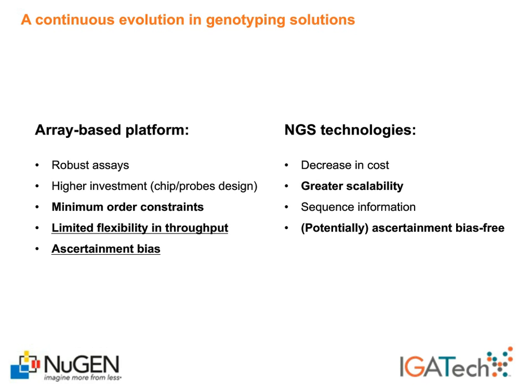And also, mainly, they suffered the so-called ascertainment bias problem, which means that researchers used to sample the diversity that was used to design the panel instead of discovering the novel diversity within the given sample under the research, be it plant germplasm or animal diversity.